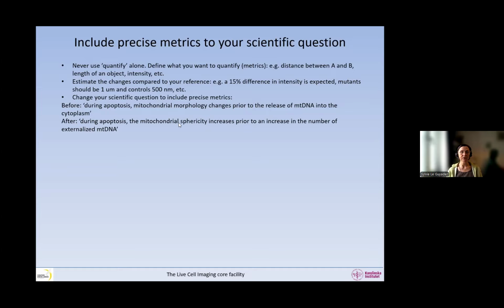Now we have two numbers that we are relating to each other: the number of DNA that are outside of the mitochondria, and the sphericity of the mitochondria, and then we compare them. So this is a proper scientific question for microscopy, and this may be kept for your whole project. From there, you will deduce what you need to measure: what is the quantifiable dimension in the image that you want to measure, and also where, so in which compartment, in which area of the sample, in which channel, and also when, if you are dealing with a live sample, after we add this or something like this.